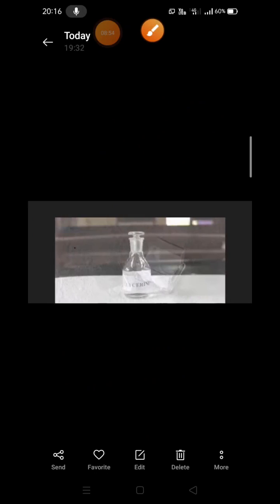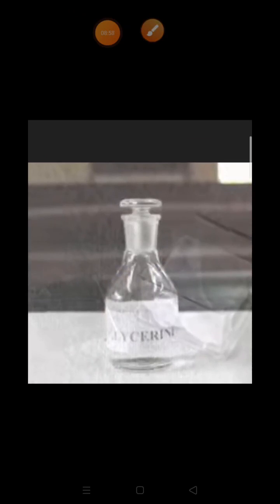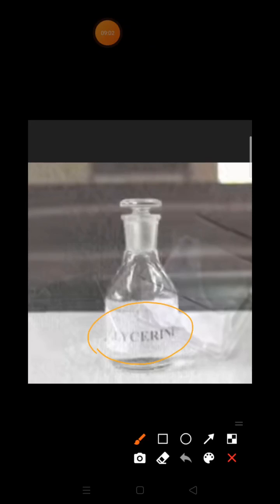Now the next material required is glycerine. Now what is the function of glycerine? As shown here, glycerine will not allow the air to enter under the cover slip when we are doing this experiment. So it is glycerine.